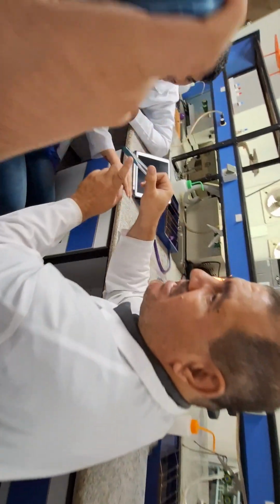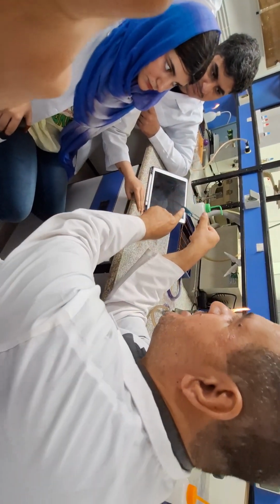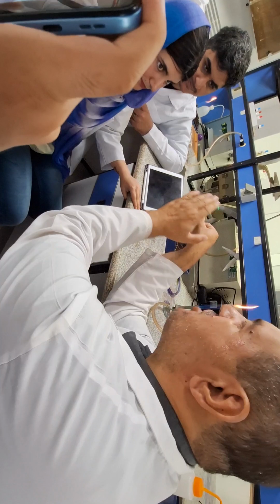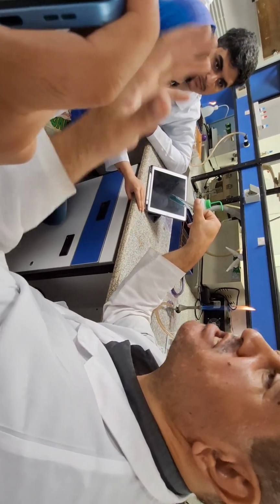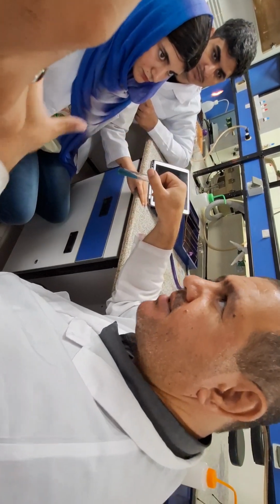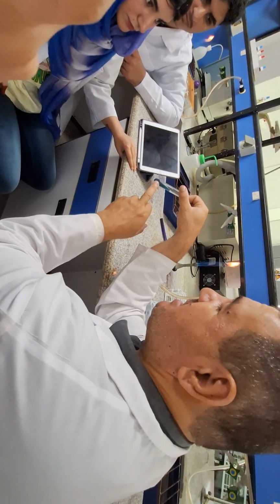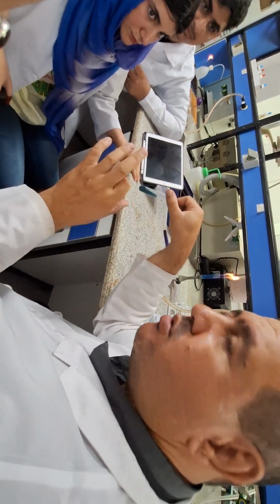Bacteria that use citrate change the color of the medium from, what is the color of the medium? Green. Change it to blue. Green to blue. Blue is a positive reaction on this medium, meaning that bacteria use citrate. The pH indicator in this medium is bromothymol blue.